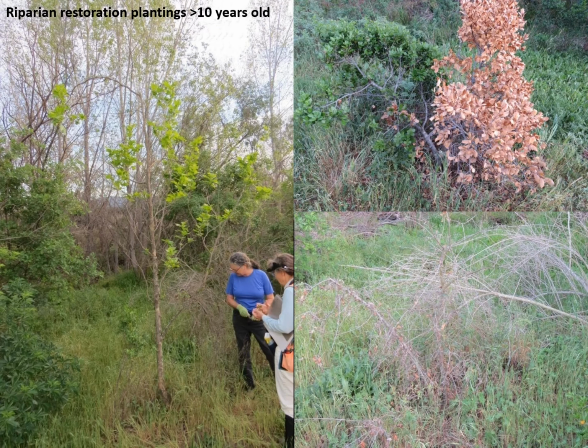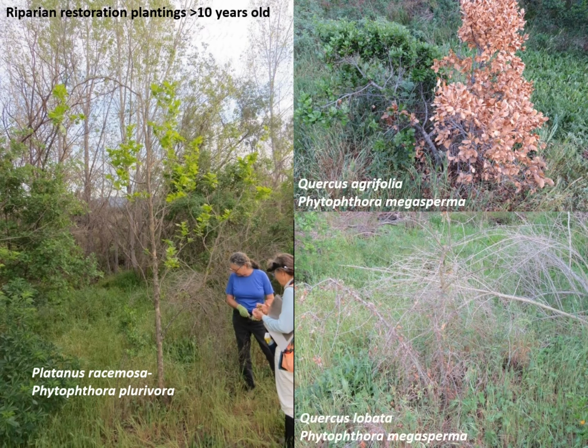One of the problems with planting these materials out into habitat is they don't necessarily die right away. They can keep living for a number of years, producing inoculum and spreading it into their surrounding environment. So here I have some plantings from restoration projects that are more than 10 years old. The plants are dying, but they've been in place and capable of spreading Phytophthora for an extended period of time.